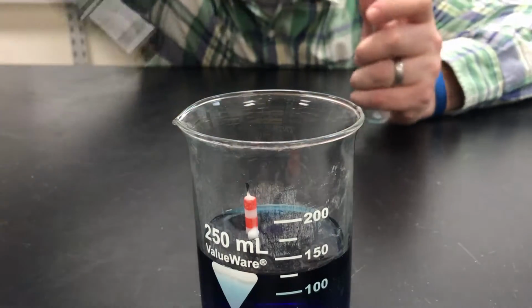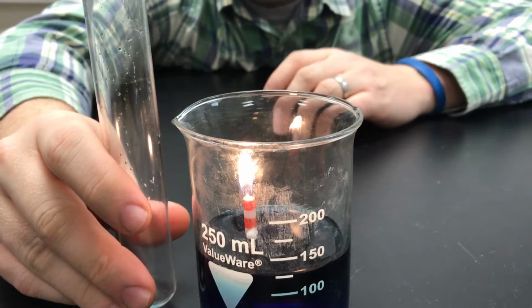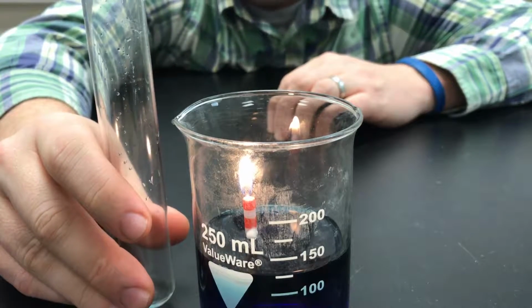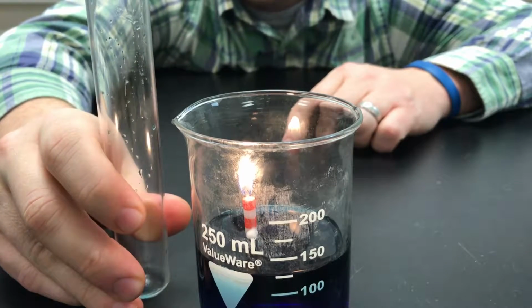So I'm going to light this candle. The candle is just placed in water. I've colored the water blue so you can see it more easily, but you won't have colored water in your lab. Now I want to use that flame to consume or get rid of the oxygen that's in the air in this test tube.